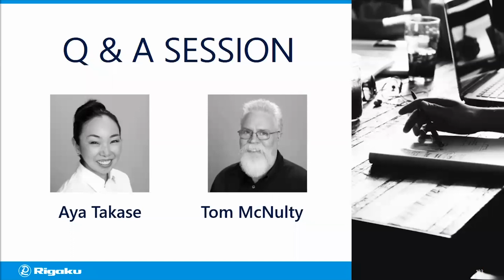Okay, thanks, Aya. Very, very interesting. And thank you so much for presenting. It appears we're going to have some time for Q&A. We have a couple of questions that have already come in. First question from John in California. Is it possible to run a sample that is larger than the FOV? For example, a tablet or capsule. And if so, what are the negative effects, if any?